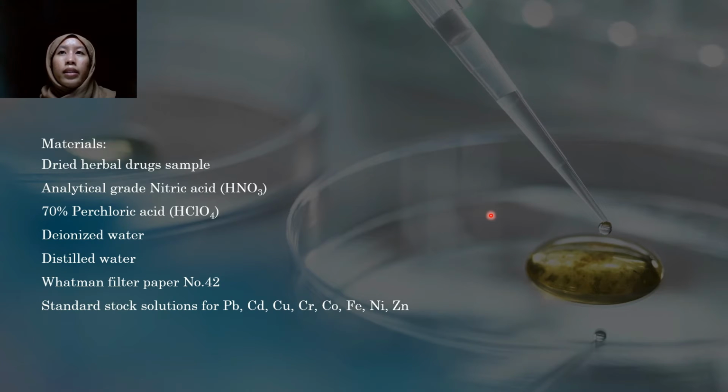The materials needed for this experiment are dried herbal drug samples, which are taken from 3 different zones from Karachi city, and there are 7 samples in total, so we have 21 samples. Analytical grade nitric acid, 70% perchloric acid, deionized water, distilled water, Whatman filter paper, and standard stock solution to test for the heavy metals.